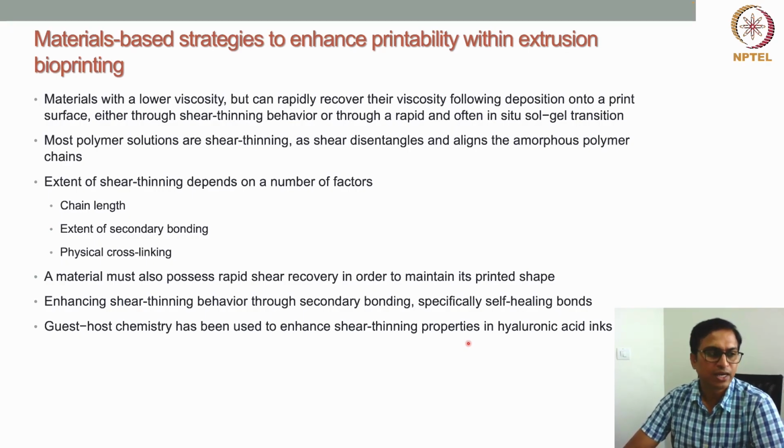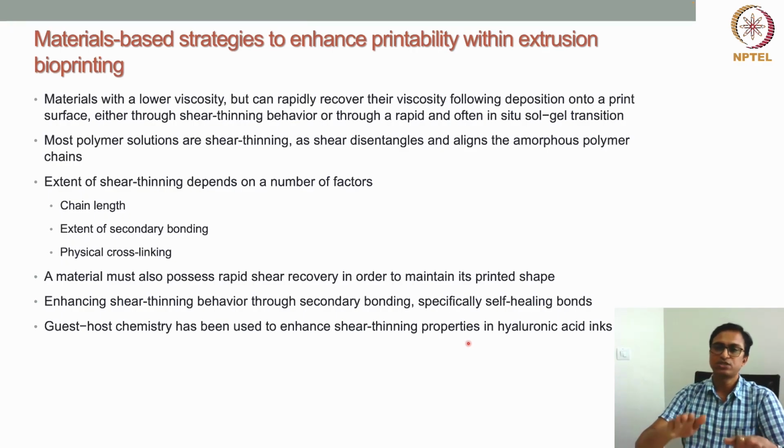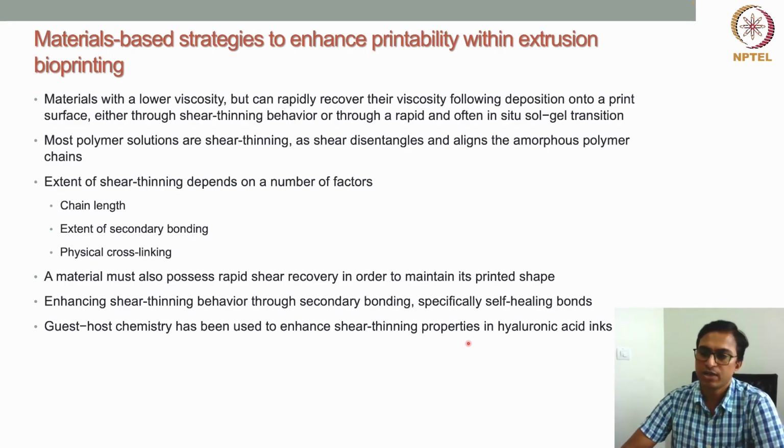But for cell culture, the cell thrives in an open porous network or low viscous environment. But for bioprinting, there are two opposing requirements here. For extrusion based bioprinting, the material requirement is that it should be high viscous, and a stiffer material is required.